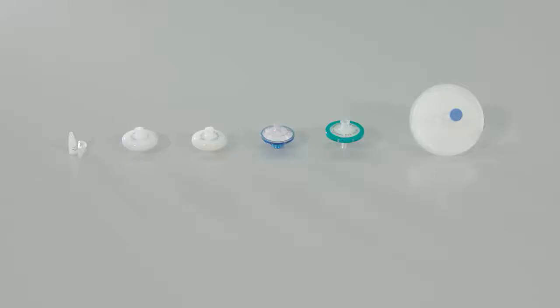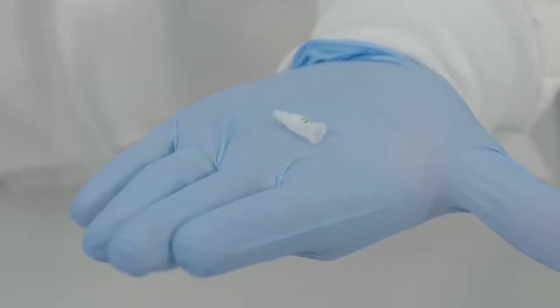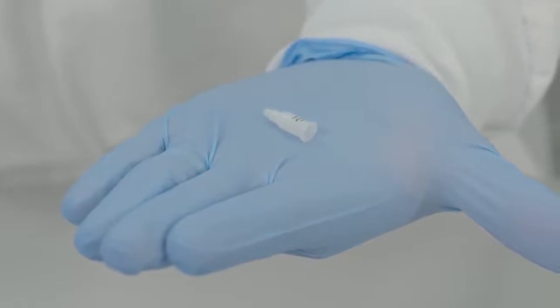Let's talk about why these syringe filters are unidirectional. The 4mm syringe filter is unidirectional because the membrane is not supported on the top side.